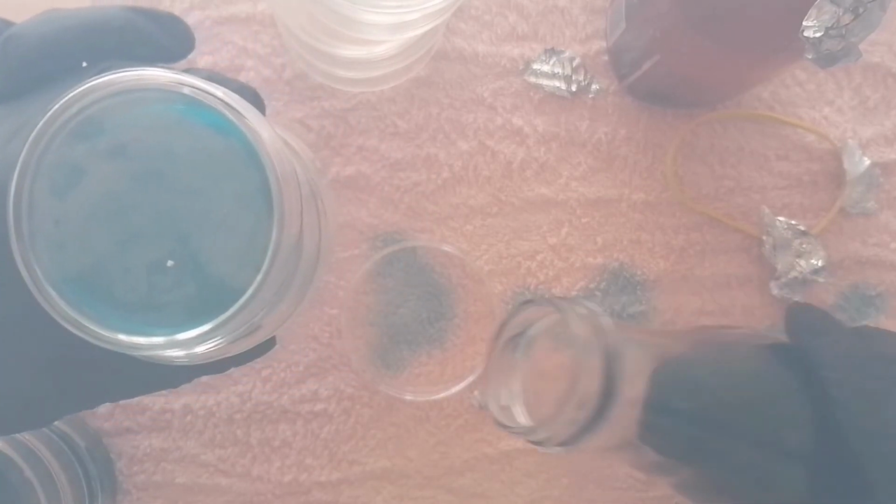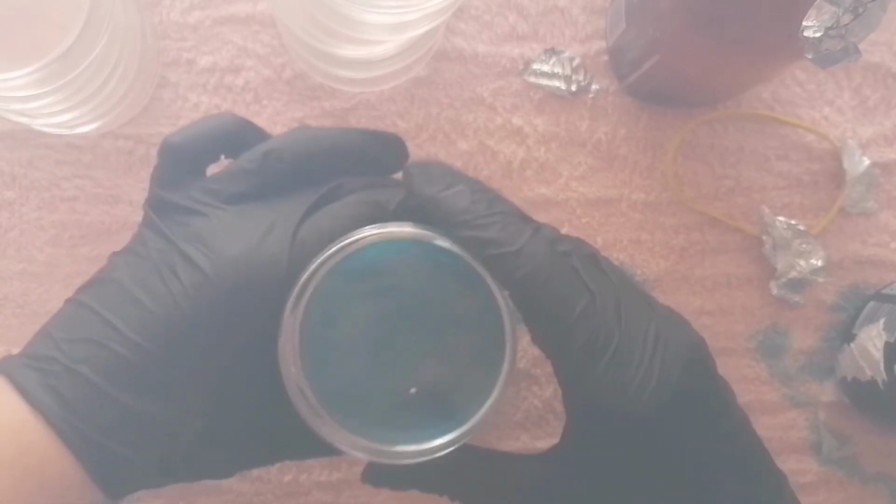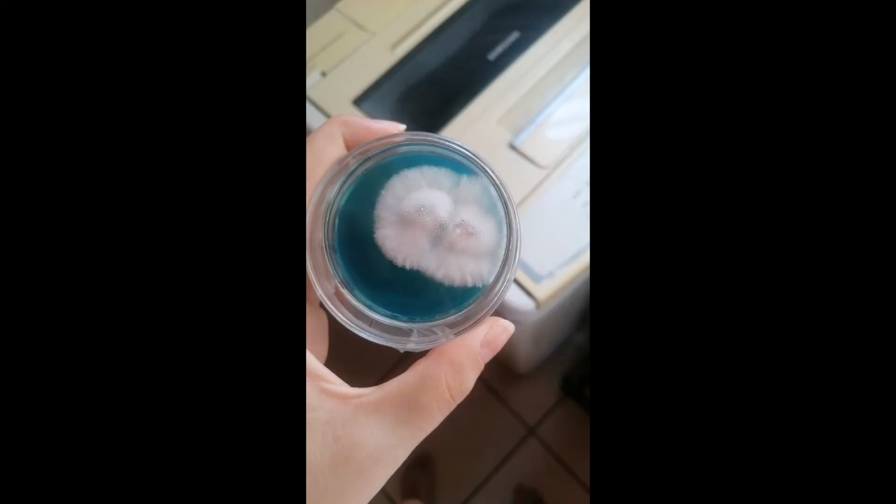Okay, and now I'm going to pour the last one. I did repeat this process until all my petri dishes were filled with agar. So then I leave them to set. After that, I will either inoculate them with some spores or I will put them in the fridge and use them for another day. So, yes, that is the process that I use.